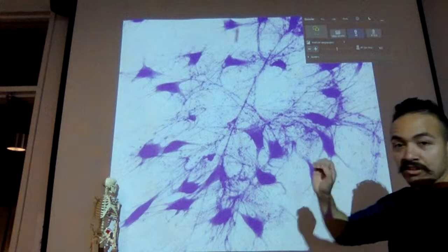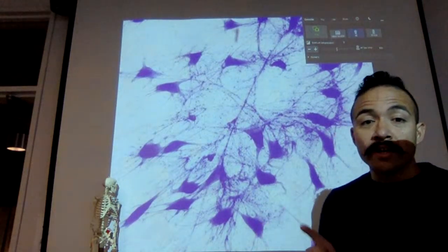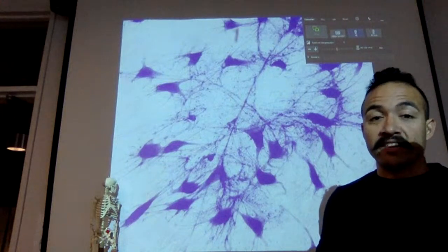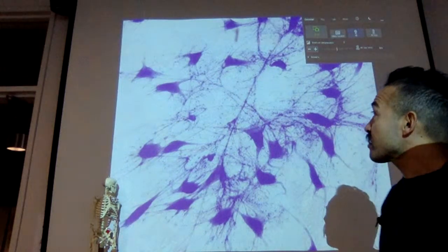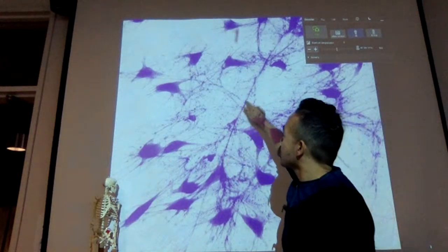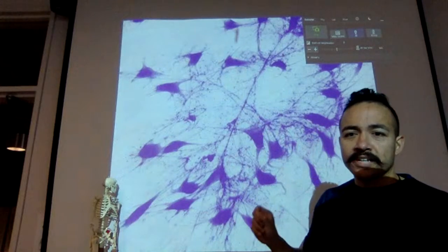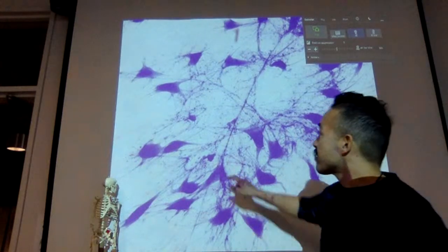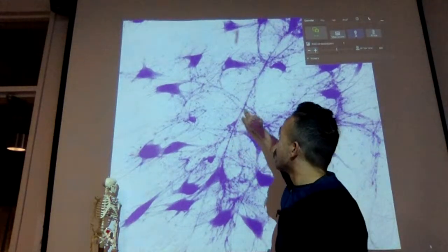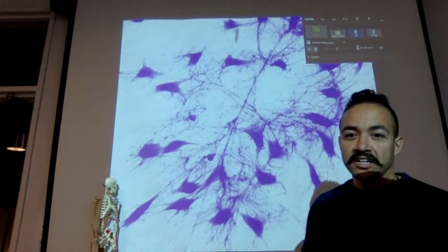There's only one glial cell where I can say with more certainty what kind of glial cell it is. If it follows along this long protrusion, it's likely one type of glial cell. First, can someone tell me what this extension of the neuron is called? What do you call this really long, broad extension?